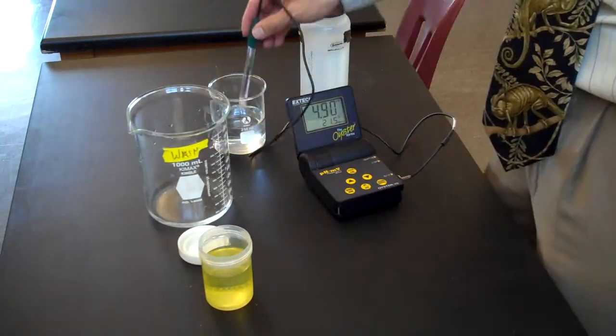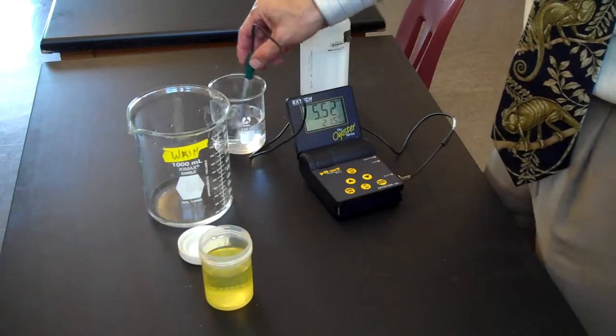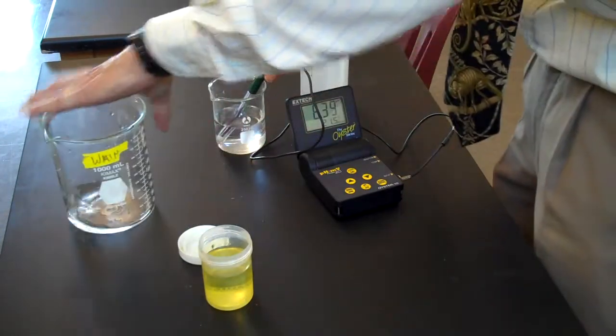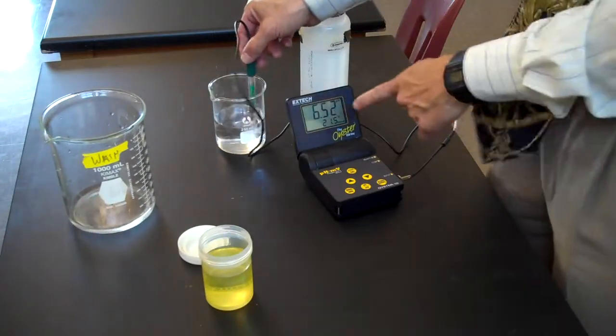Now I can immerse the electrode into the solution that I'm measuring. I'm stirring gently, stirring gently until I get a stable reading on the meter.